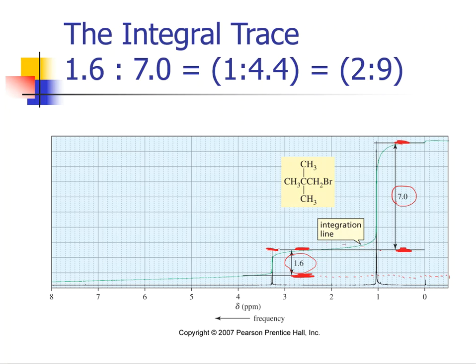So that's basically how they've drawn the horizontal lines on the NMR. I want you to think of this lowest one as the area that's at the top of the TMS, and then this next line will begin at the top of the lowest signal, and then that line will continue up until the max of the next highest signal. That is how those lines are generated.